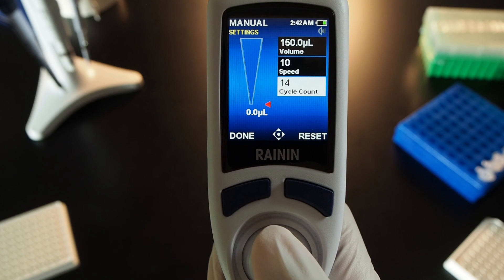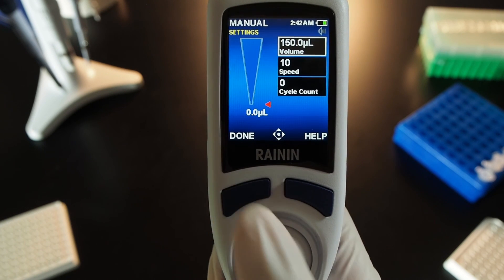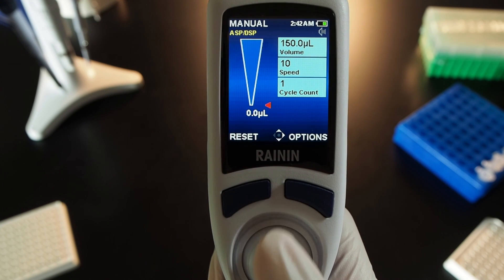You can use the joystick to change the number, or press reset to set the cycle count number to zero. Then aspirate and dispense and notice the cycle counter registering each cycle.